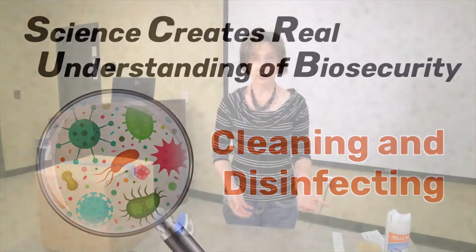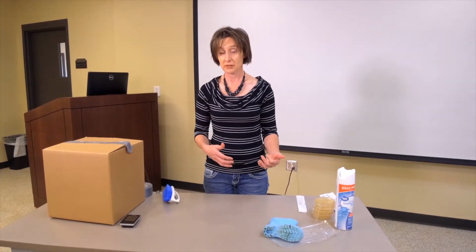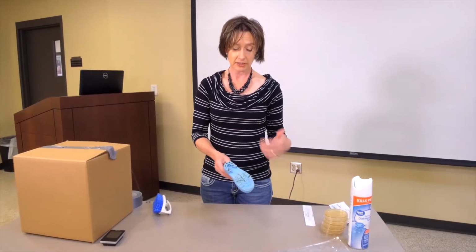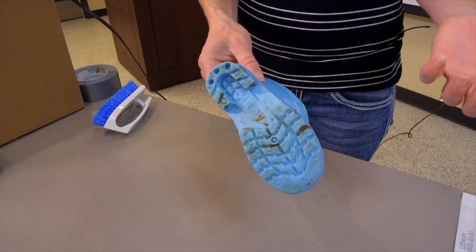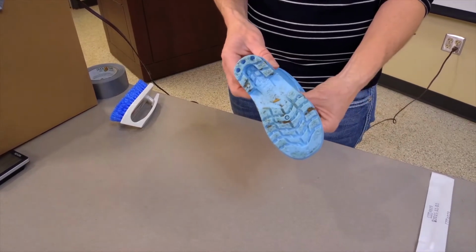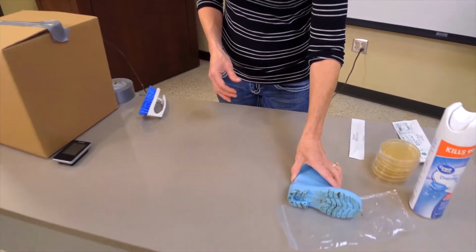In Activity C of our scrub curriculum, we're actually going to ask the students to plate bacteria from boots that they have cleaned properly following instructions, and then what might be a little bit more typical. Commonly, we see people that may not actually clean their boots properly, and there's a lot of cracks and crevices on boots that are typically used in animal facilities. Essentially, all that tread that helps keep us from slipping really can be a reservoir of pathogen in case we have disease outbreaks. So again, we're going to be plating our boots.